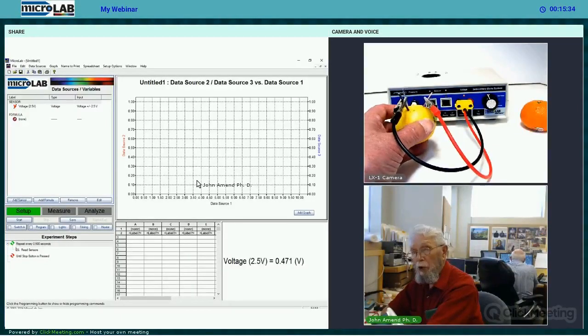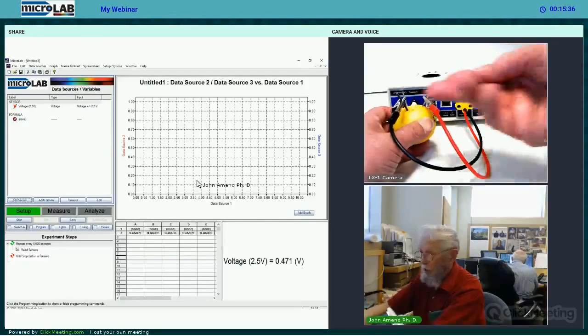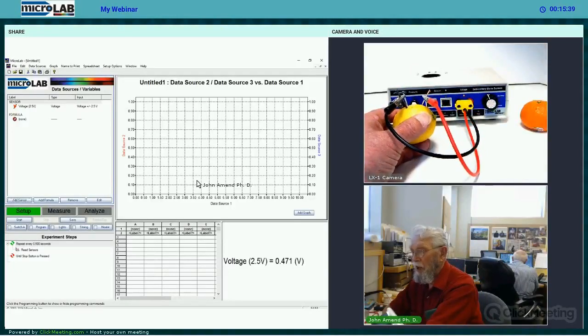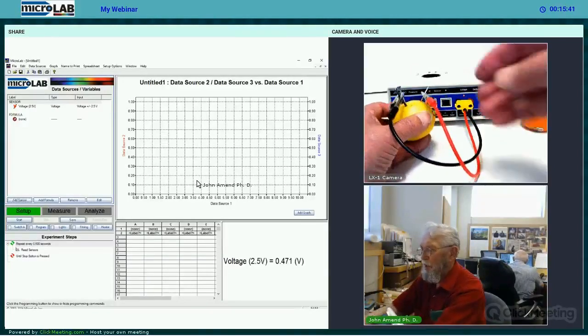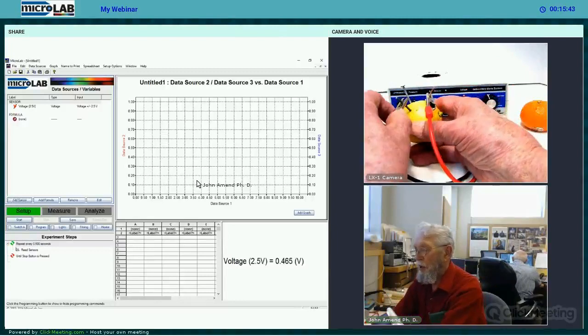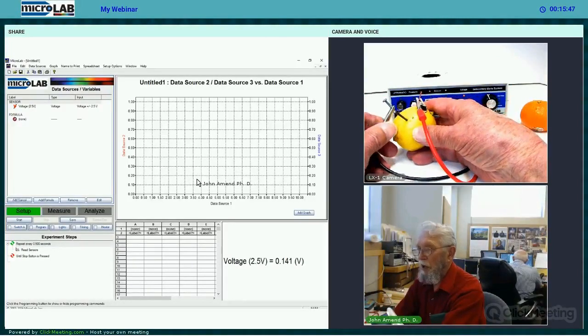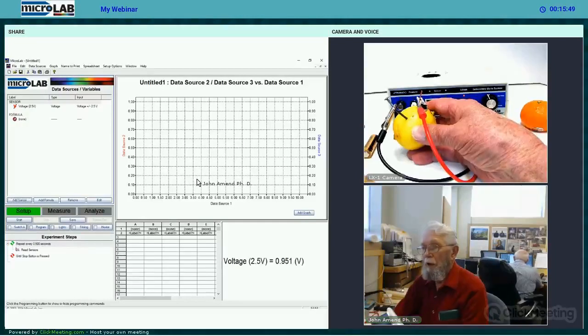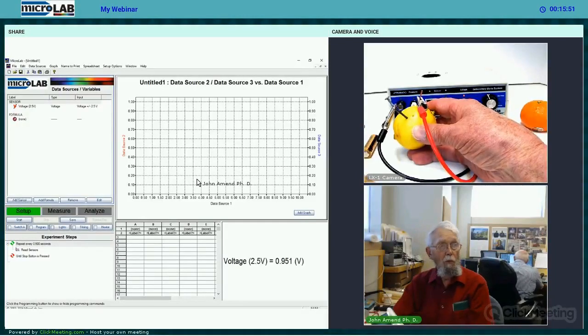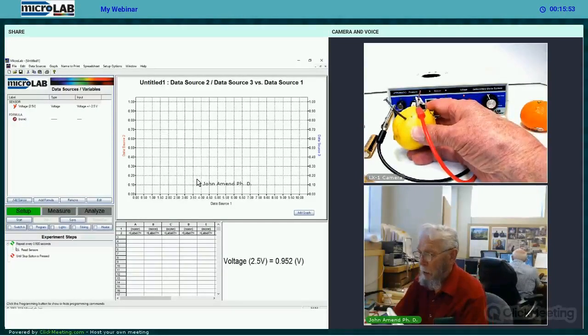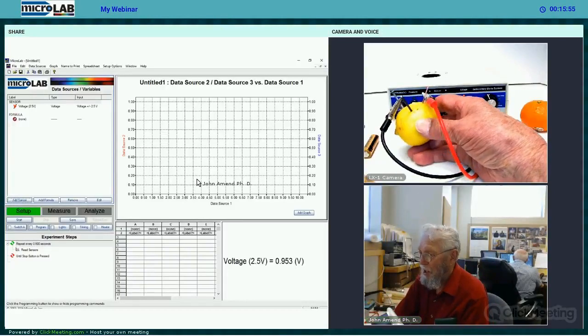And we get only 0.47 volts. Well, okay. It's a different voltage. Based in part, certainly, on the difference in the electrode. Just to make sure we're still on the right page, let's review that zinc one once again. And we're coming up in the same 1 volt neighborhood again. Well, that's kind of an interesting thing.